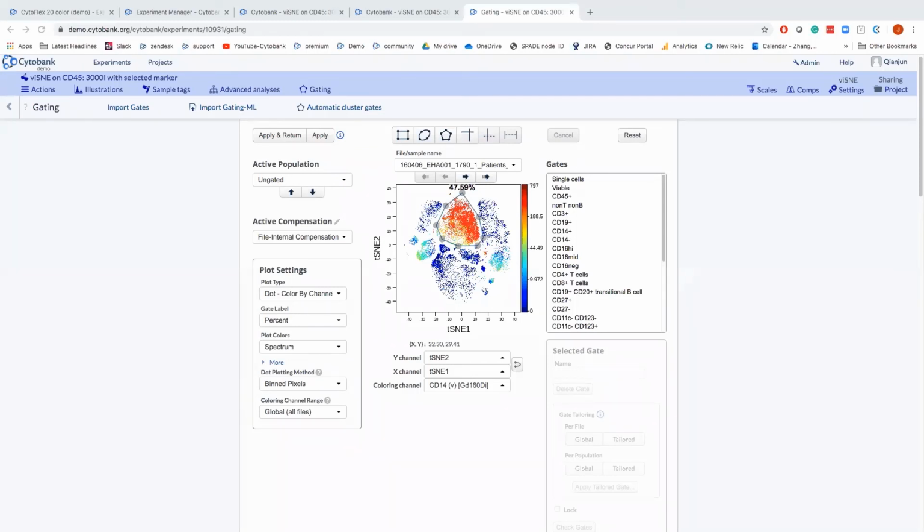oh my goodness, I'm blanking out. On Citrus next Tuesday. Citrus, thank you so much. Yes, that's right. So please join us in those sessions, and they will definitely be very useful algorithms for longitudinal experimental analysis.